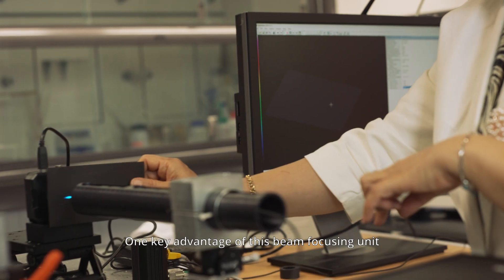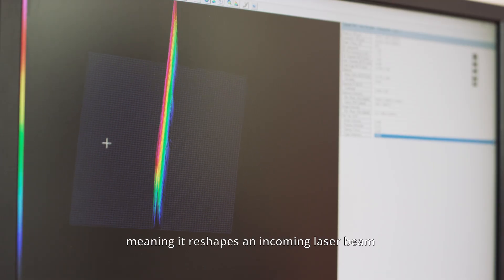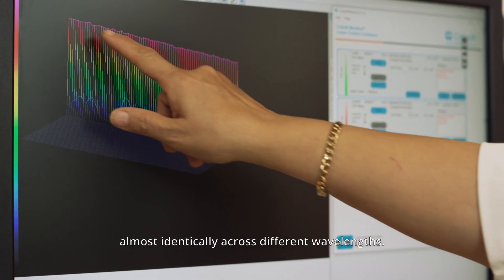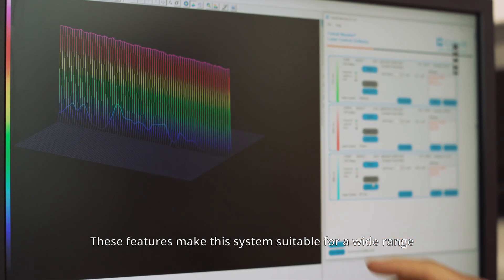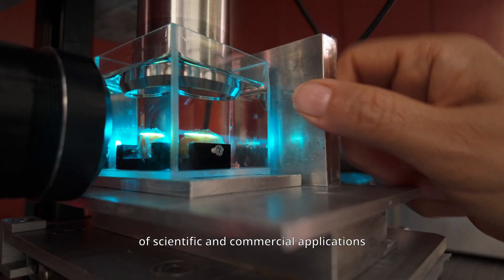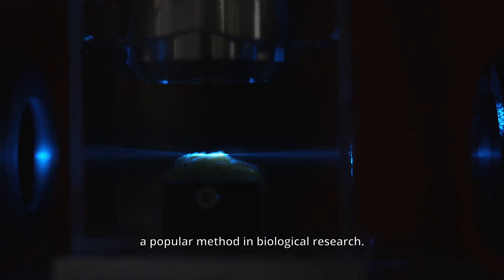One key advantage of this beam focusing unit is its achromaticity, meaning it reshapes an incoming laser beam almost identically across different wavelengths. These features make this system suitable for a wide range of scientific and commercial applications, particularly in light-sheet microscopy, a popular method in biological research.